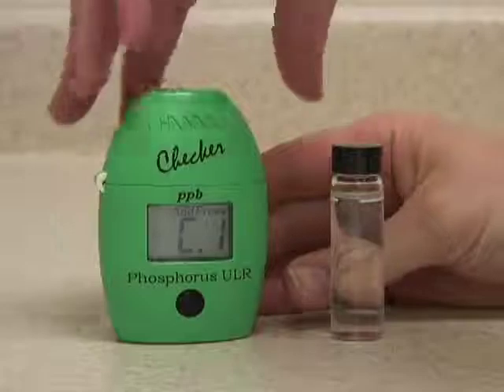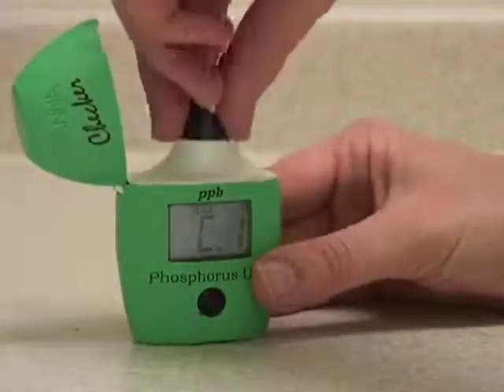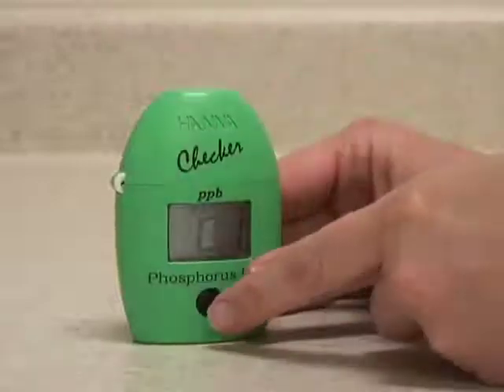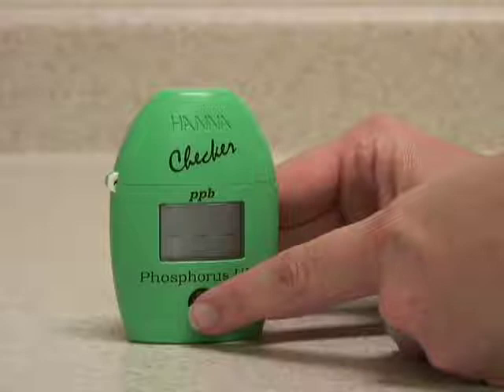As it displays C1, insert the vial to zero the sample. This contains your unreacted water. Press the button again to zero the instrument, which calibrates it to your water.